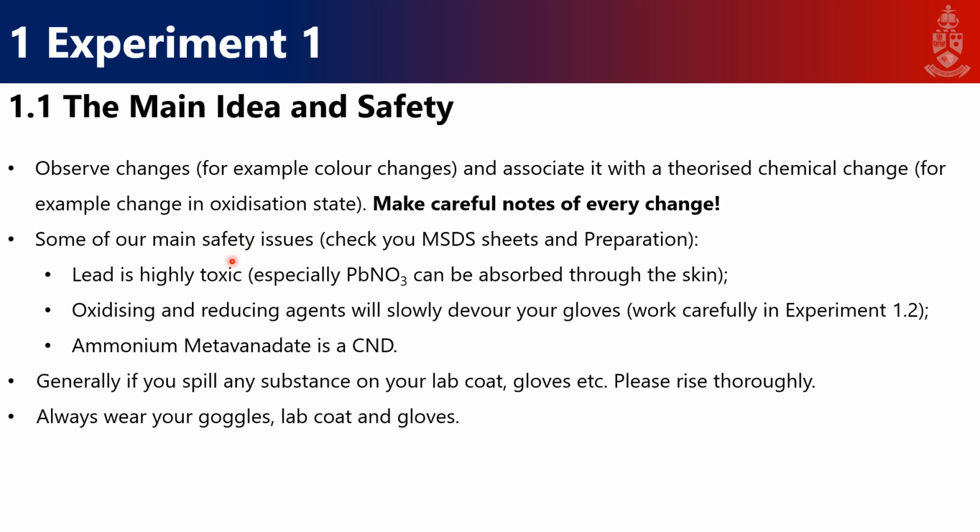It's our main goal. But unfortunately, or maybe even fortunately, it comes with some risks. For example, we'll have to work with some lead nitrate, which can easily be absorbed through the skin. Of course, lead is a highly toxic metal, and in its lead nitrate form, it's fully dissolved and hence can be easily absorbed. Not unlike, for example, lead chloride, which struggles to dissolve. But anyway, you'll also be working with oxidizing and reducing agents, which will devour your gloves. It's an eye irritant, a skin irritant. It is something to watch out for and just be cognizant of.